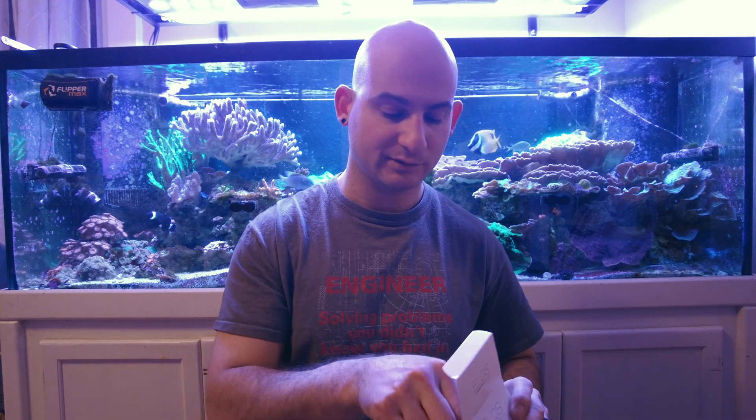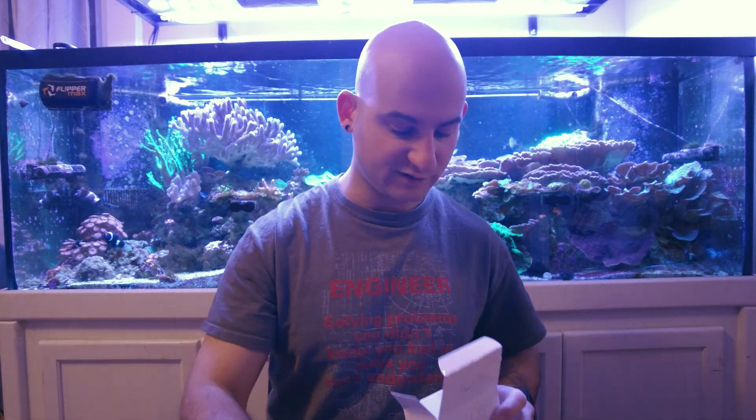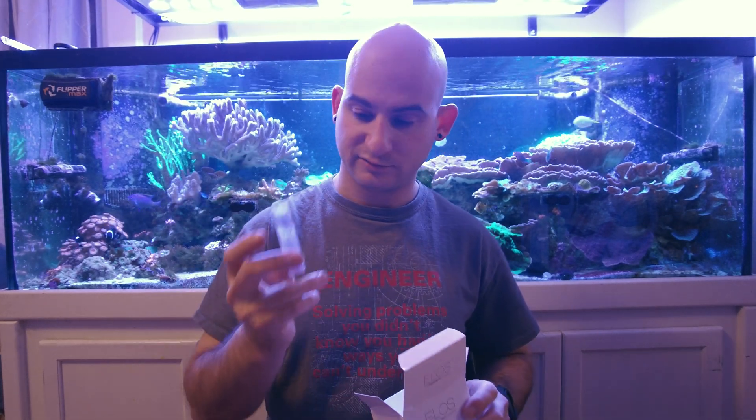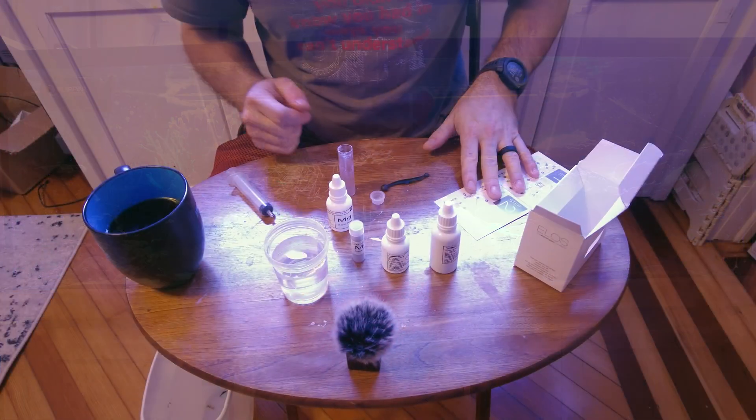It comes with Reagent A, Reagent B, Reagent C as a powder, D as a dropper, a vial, a little stopper, and a spoon. I also have a sample of tank water already pulled out so I don't have to get up.